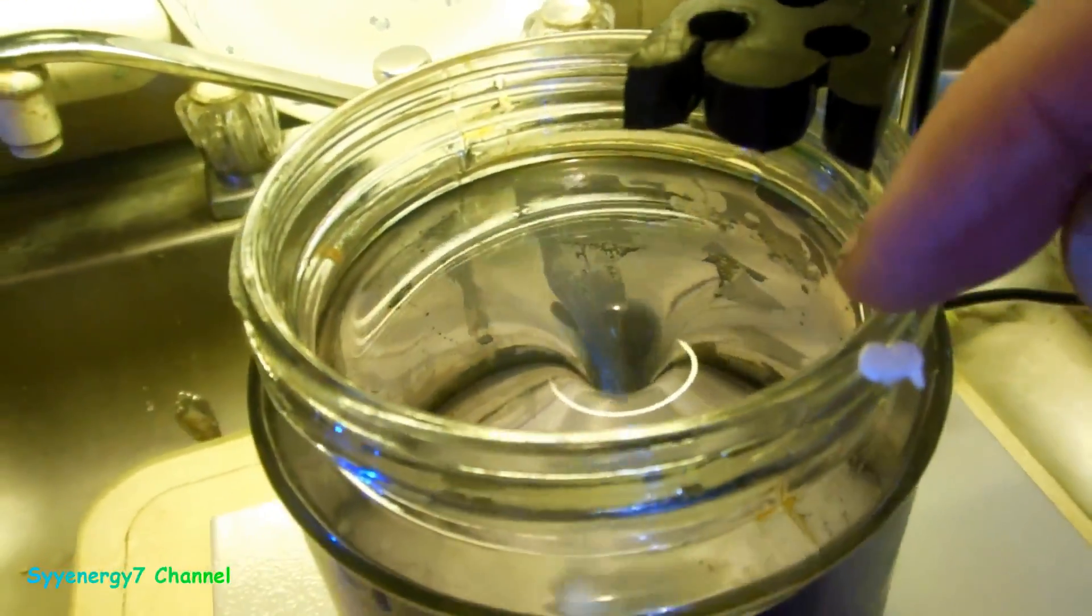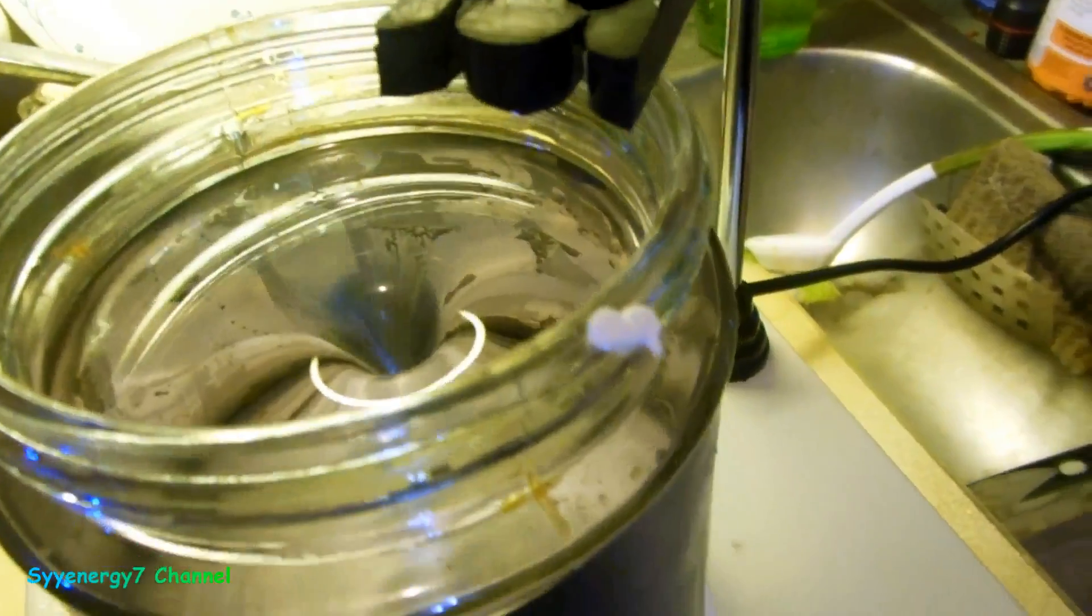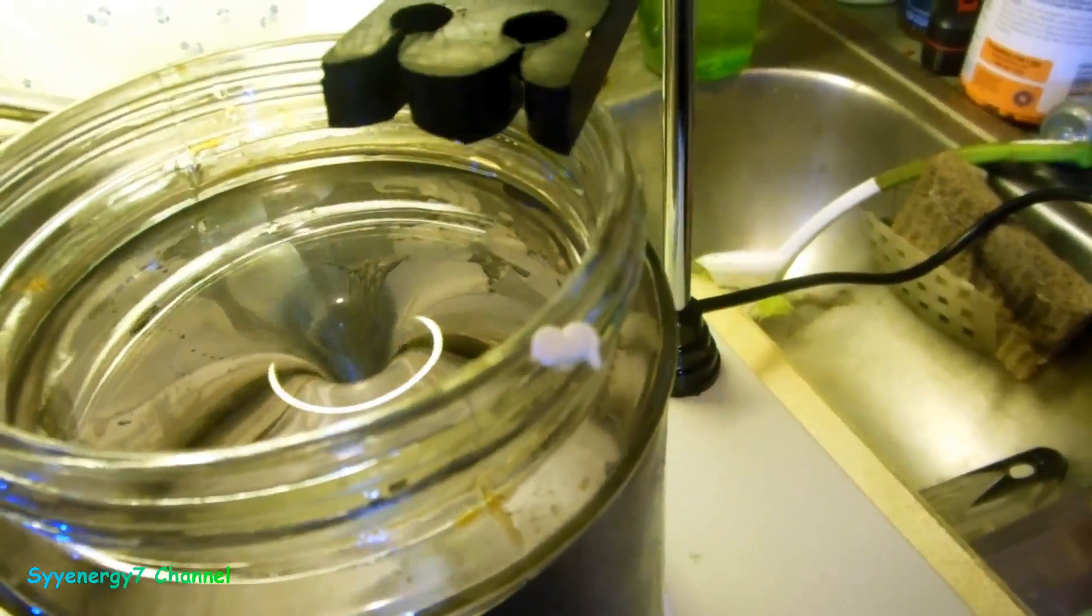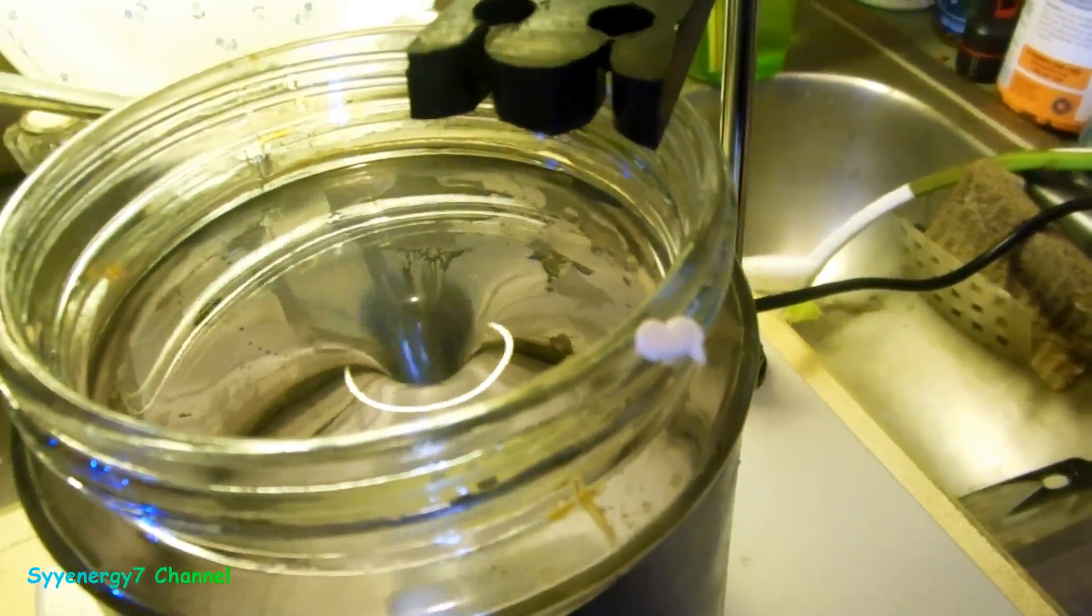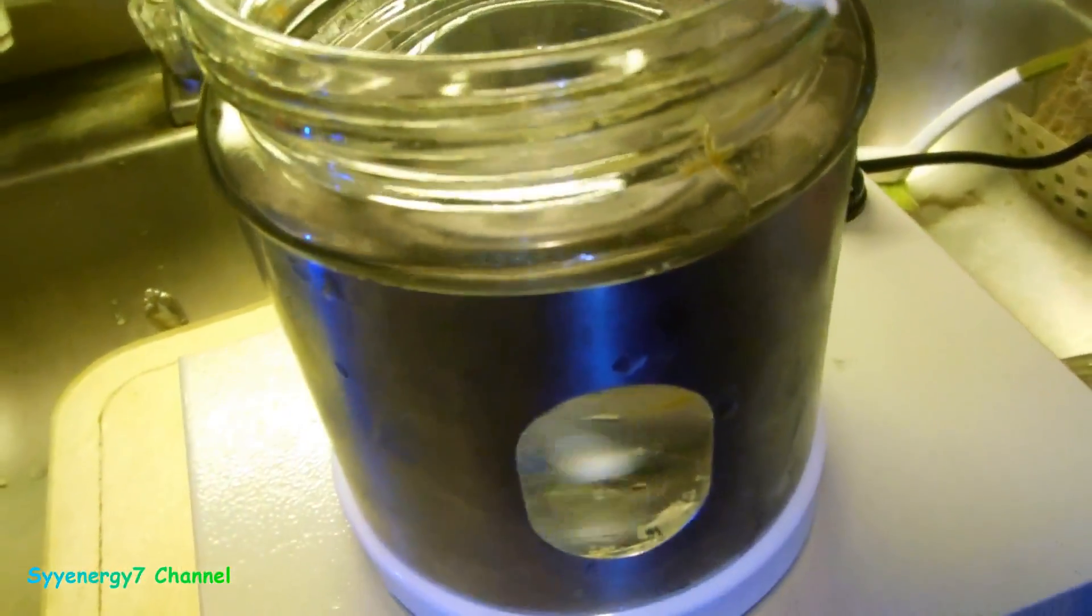So that's the thing you need for making colloidal silver. And I guess there's an added precaution. I would put the lid on here like loose or something and put the top on like that.